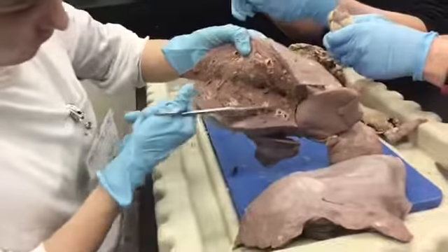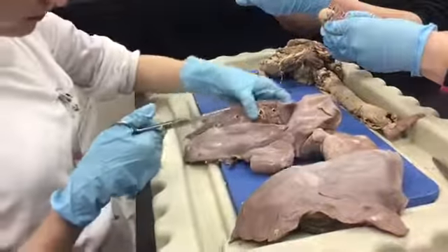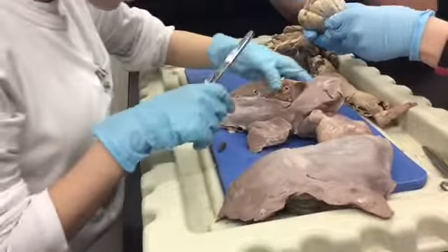All right, at this point in time, we need to clean up. Put everything in the red trash can. Those are the bronchioles, and then the alveoli are in there somewhere. The red trash can is right there.